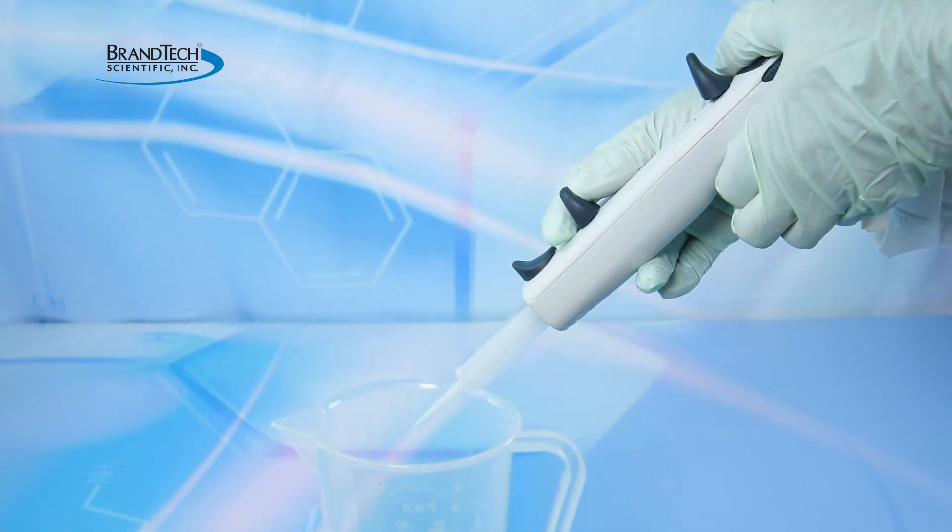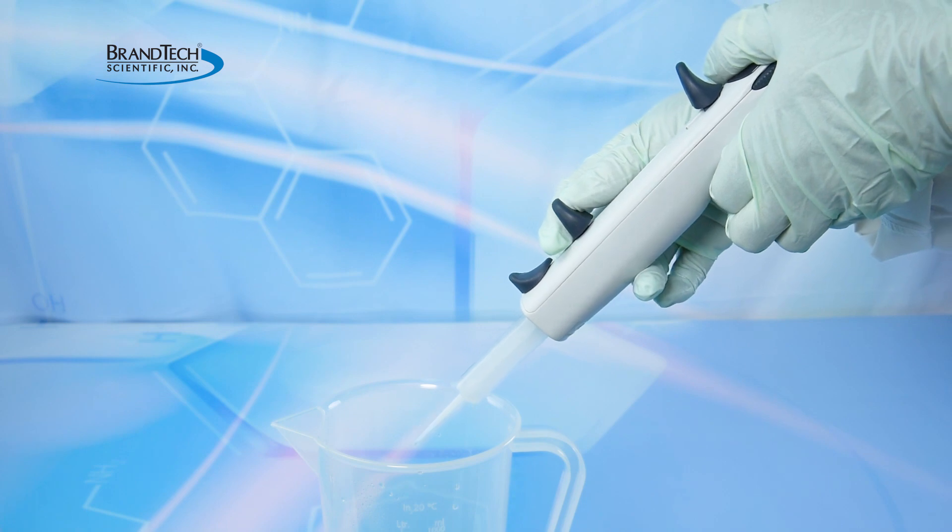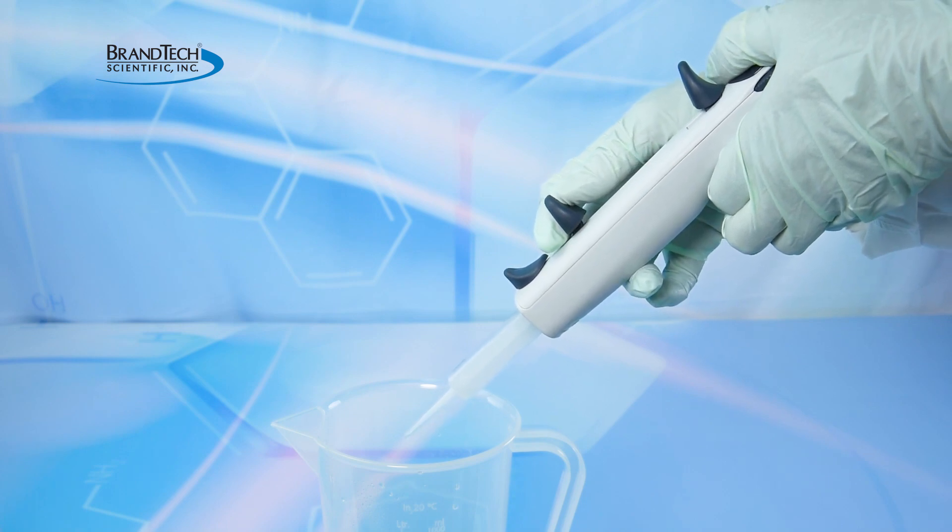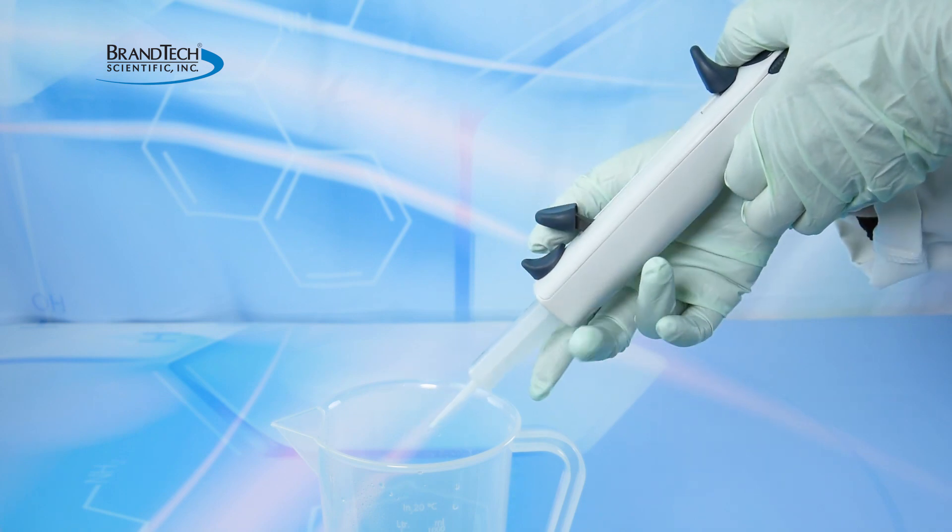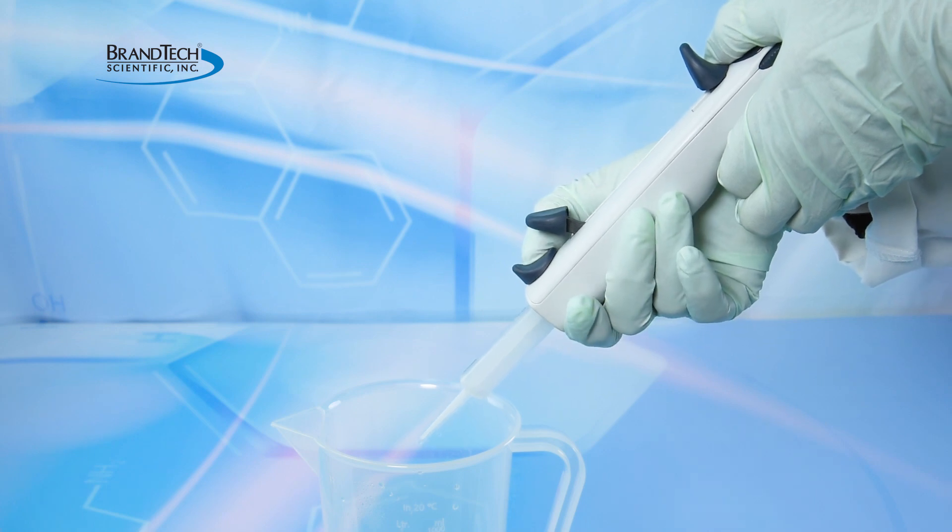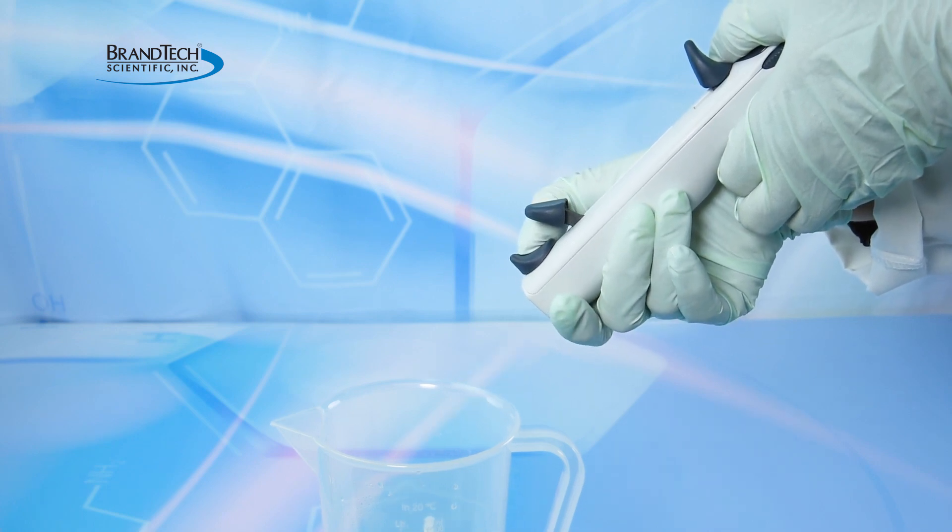Once you have completed the dispensing, the PD tip should be removed. Push the locking filling lever to the lower position and swing out the lever into the unlocked position, then push the ejection button to discard the PD tip.